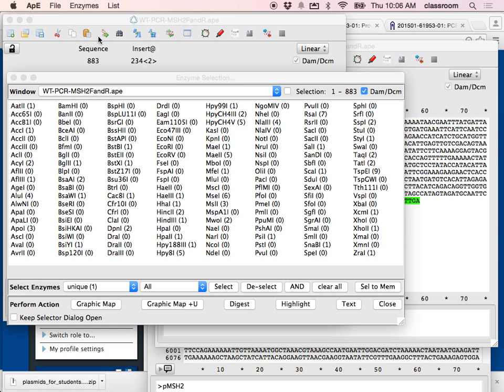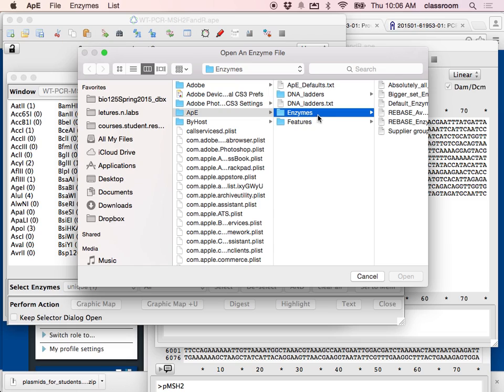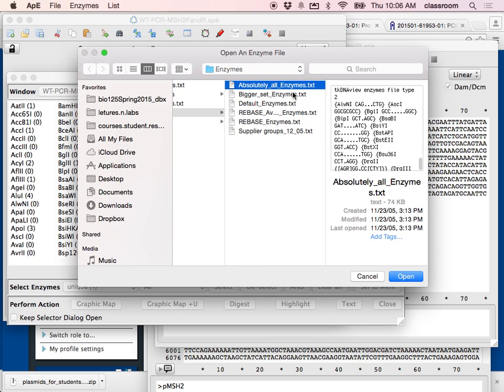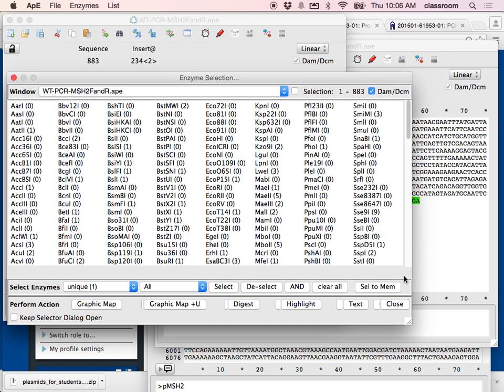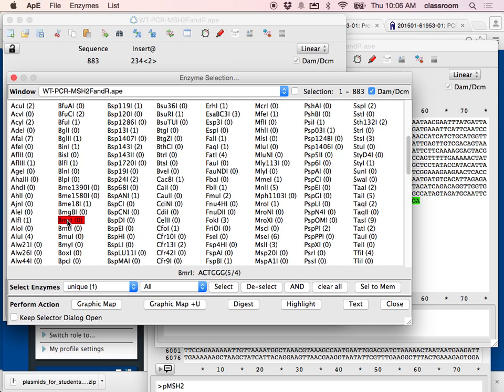The enzyme file folder for APE opens — it's a bit slow. There is a file called 'absolutely all enzyme' — select that file because it has many many enzyme entries. Open it, and now search for BMR1. Going through the list: BS, BV, BMR1 — there it is. However, I see BMR1 shows 0 cuts — it does not cut the wild type.